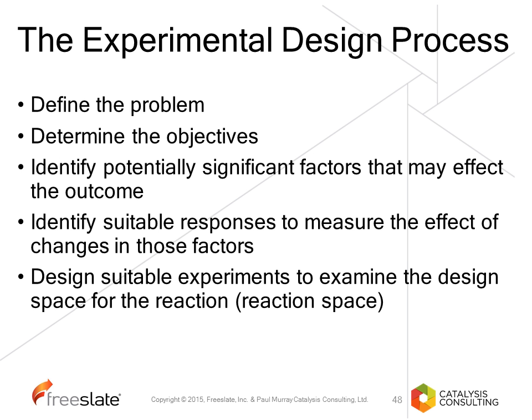The first thing is, why are you carrying out the experimental design? So you need to define what the problem is. And often when you start with a process or start with a chemical reaction, you want to improve it. The objective may be to get 100% yield, but you need to break this down into maybe smaller objectives or smaller sets of problems to try and solve.